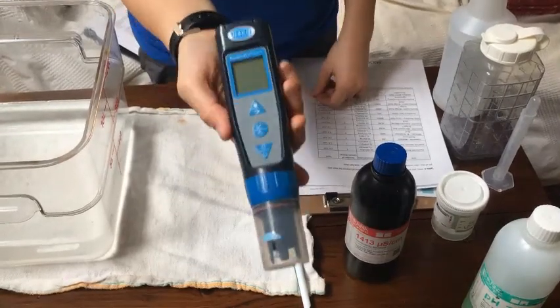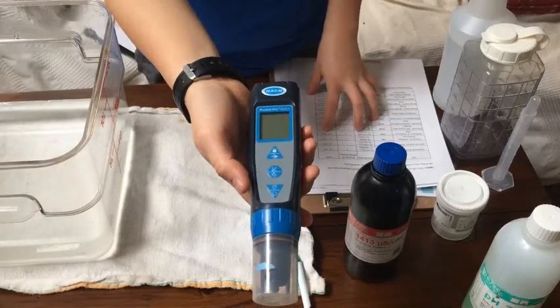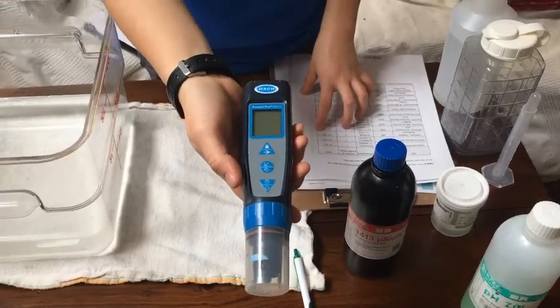This is calibrating the Hatch Pocket Pro. You're going to be calibrating every single time you go out before you start water testing.